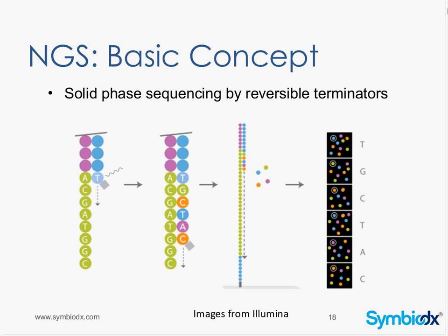So this is a thing that's truly unique about next-generation sequencing and has really made this technology possible, something that has made it so revolutionary. This is where we can actually sequence each one of those fragments individually so that we have the entire sequence for each of them. The way this is achieved is a technology that's kind of a spin-off from that traditional Sanger sequencing. So what happens is we have a reversible dye terminator base that we add to the next strand of our sequence, similar to what we would do in Sanger sequencing.